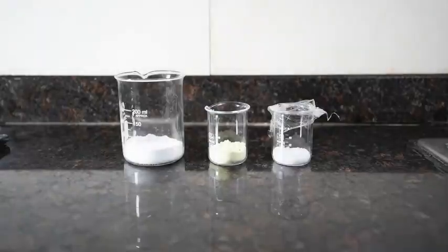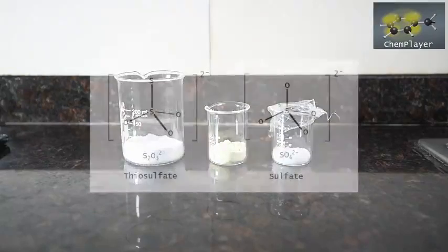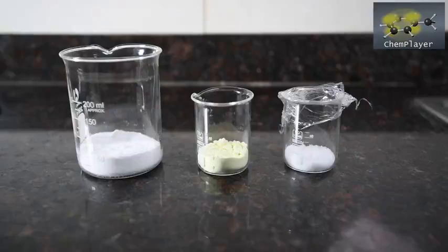Today we've got a nice little experiment and we're preparing sodium thiosulfate, a useful compound to have around the lab. Thiosulfate is a bit like sulfate, only with one of the four oxygen atoms having been replaced with a sulfur atom. In theory it's easy to make, so let's have a go.